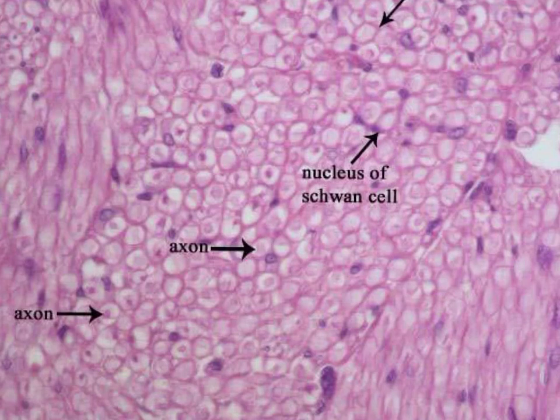And then if you have a label for the red circle, it is the neurolemmal sheath. If you have a label for the nucleus on this red circle, it is the nucleus of the Schwann cell. And of course you know that the neurolemmal sheath is formed by the Schwann cell. But in order not to make a mistake in your answer, it's better to give this circle the label neurolemmal sheath or membrane, and this is the nucleus of the Schwann cell.